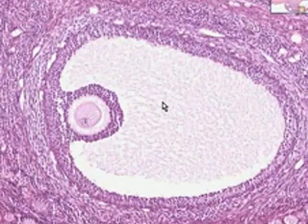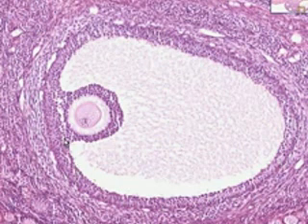This is now a Graafian follicle. A Graafian follicle has a large antrum, a lot of granulosa cells surrounding the whole follicle, and a lot of granulosa cells surrounding the ovum too, generally called the cumulus oophorus. And here is the actual ovum.